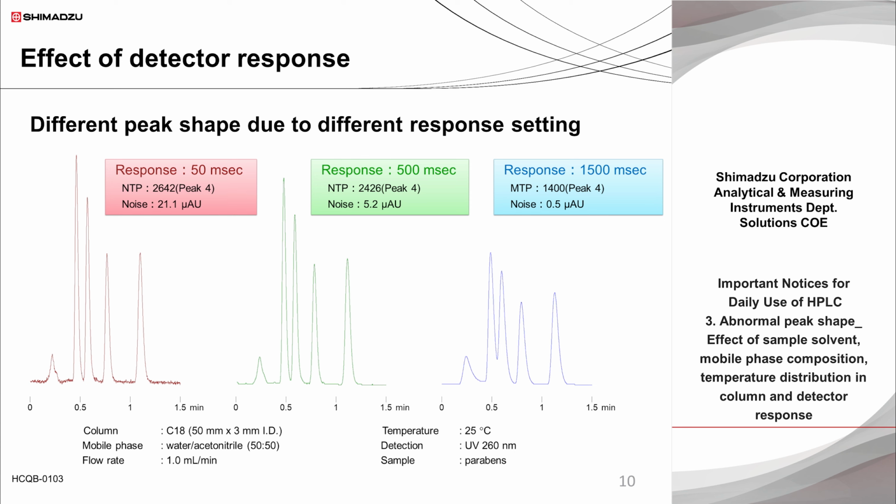The following second interval starts from the second point, which is just after the first point; consequently, almost all of the second interval overlaps the first interval, and the calculated value is output as the second data point. The length of the interval and data point resolution have no concern. When the signal variation is identical, a short interval means large output, as is shown here. A twofold longer response time setting does not always mean half of the peak height due to employing a special weighting method for the average calculation.